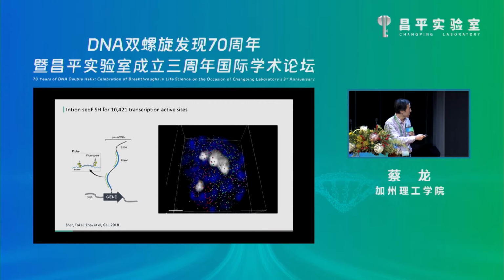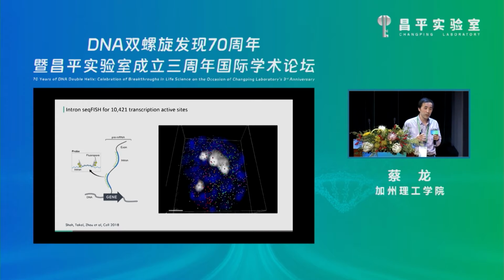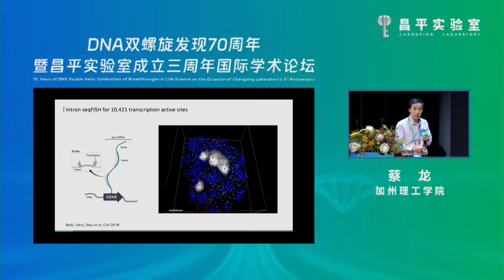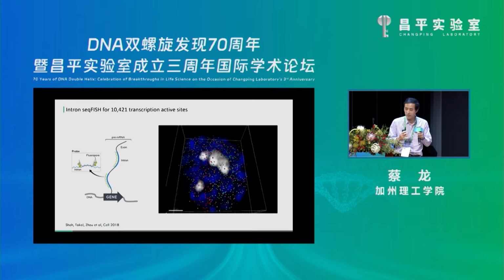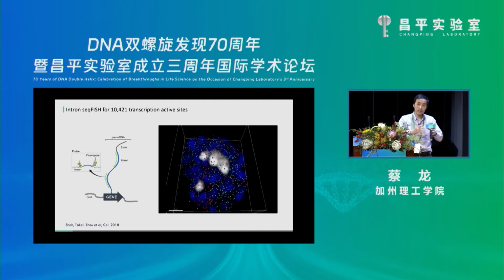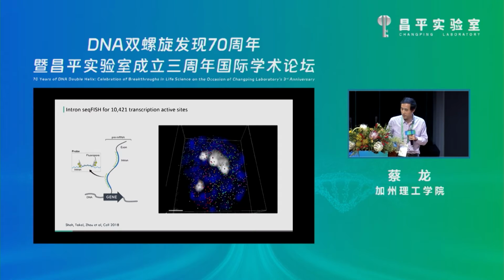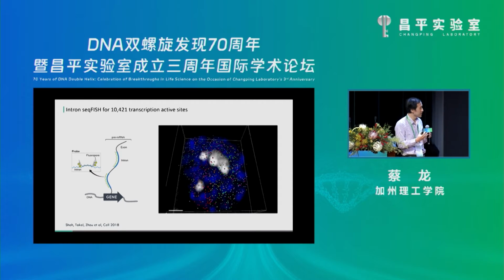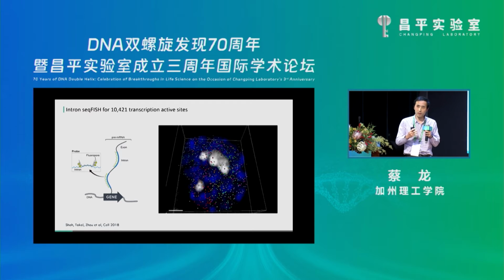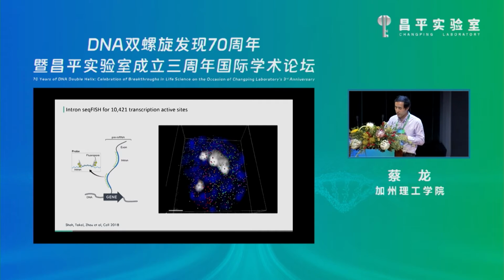And you can see that the nascent transcription happens essentially uniformly across the entire nucleus. And these dots are color-coded according to the chromosome. So the chromosomes form distinct territories in their active sites, but basically there are no major transcription factories; they're all spread out in the nucleus. And in some sense, we kind of cheated in this experiment because the number of transcription active sites per cell is fairly limited, right? So we don't run into this density issue.